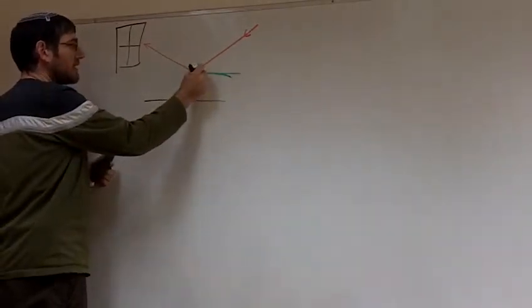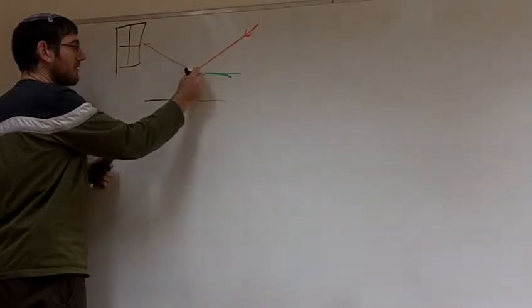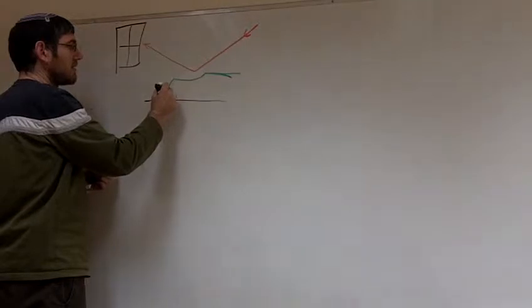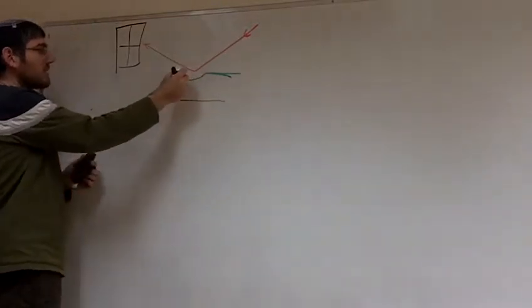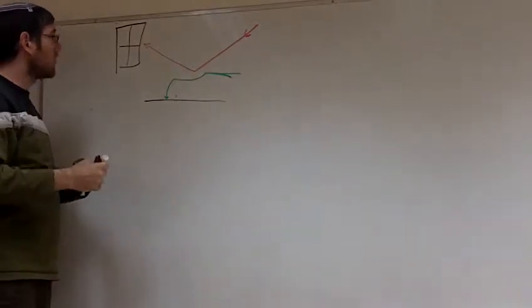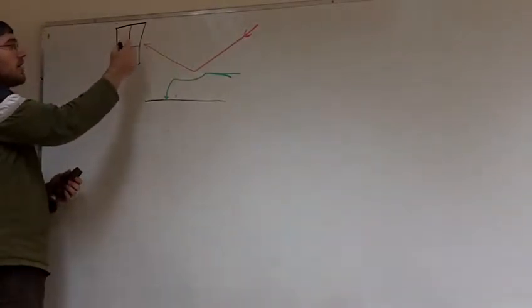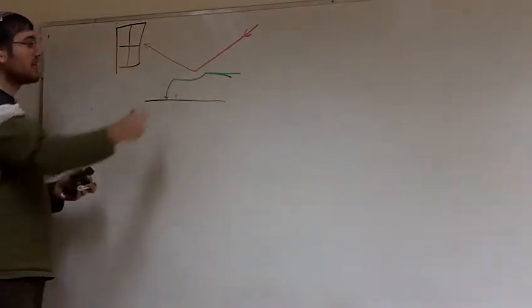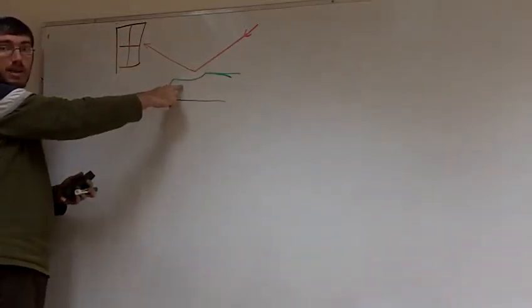We'll have a certain deformation. Let's say we'll go a little bit down. And then the laser will hit a different area on the PSD. So what we're doing is we're always monitoring where the laser is hitting this detector, and that's how we know what's going on with the tip.